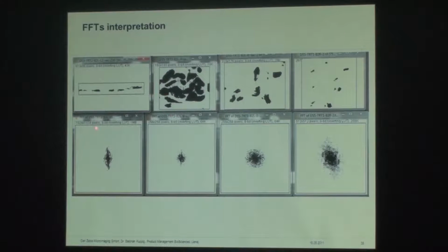Okay, particularly for biologists, I give this introduction to make a quick understanding of what FFT does. My understanding is that FFT is a complex mathematical algorithm which is sophisticated, and you can get information from it that is impossible to get from the spatial domain.